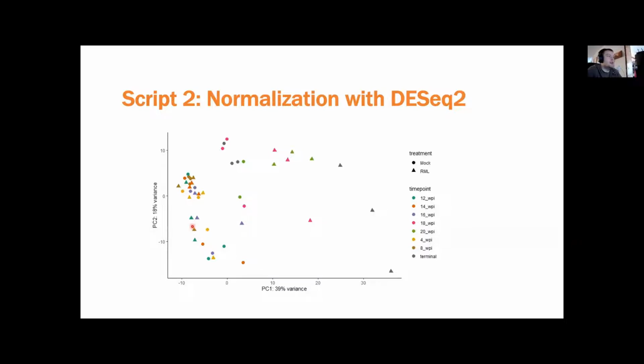There are various ways you can deal with it. There are ways you can actually eliminate batch effects in the normalization using DESeq2, or you can do subgroup analysis by only considering samples within each cluster. That's beyond the scope of what I'll be going over for today's tutorial, but it's something to keep in mind when you're analyzing your own data.